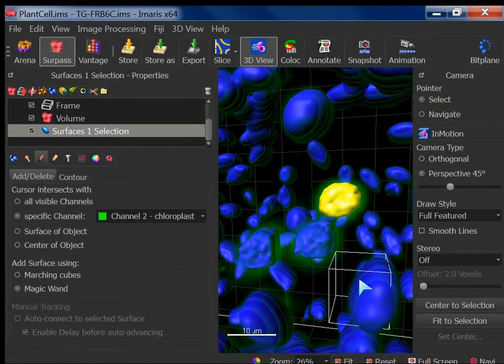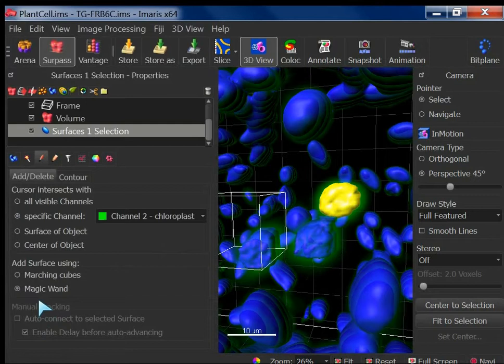Yeah, still. So this algorithm, I know why it's not changing this shape, is because every algorithm has termination criteria, or what you call the number of iterations. So maybe this iteration has just reached the maximum level. That's all. So it is possible, but then you have to code it, right? But I think it has done a nice job here.